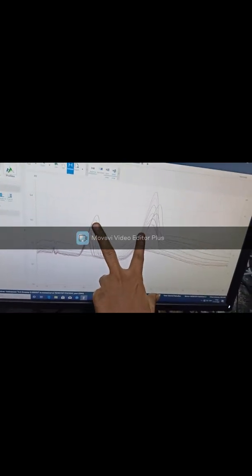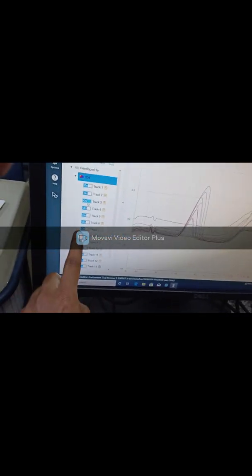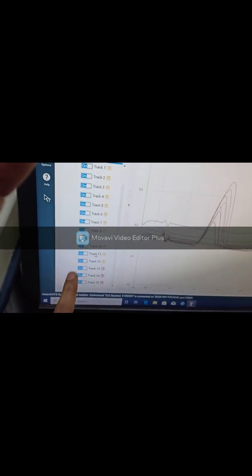The higher retention factor corresponds to benzophenone because it has traveled a larger distance, while the lower retention factor corresponds to benzhydrol, and the sample has both bands. You can see there are 15 tracks: the first 6 are benzophenone, the next 6 are benzhydrol, and the last 3 are from samples.